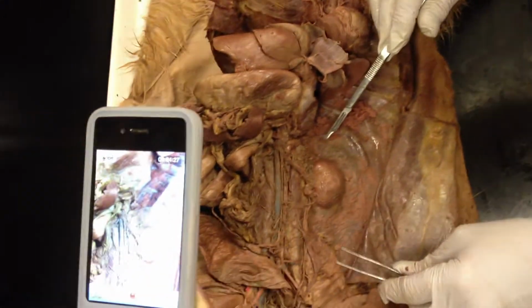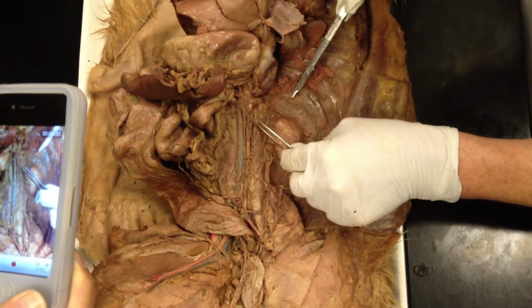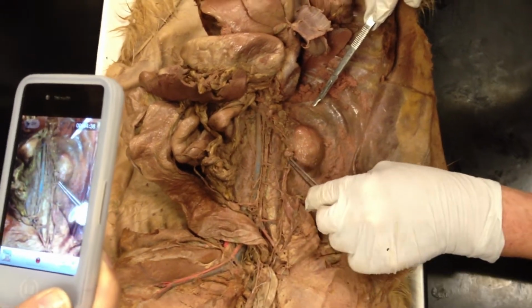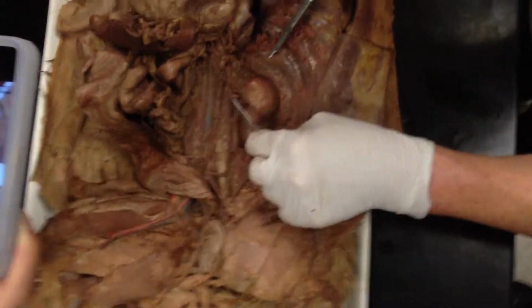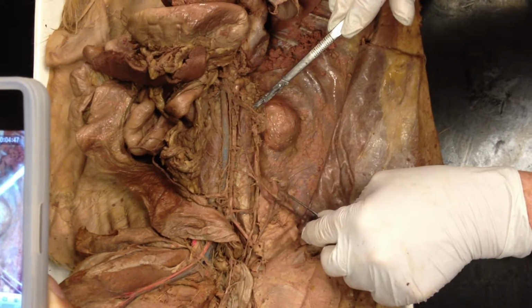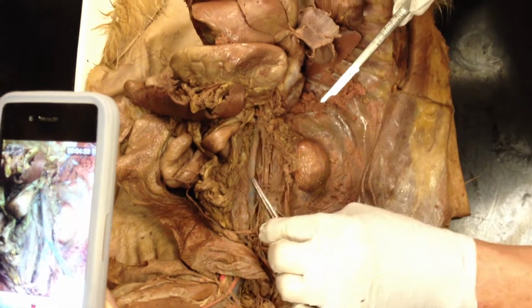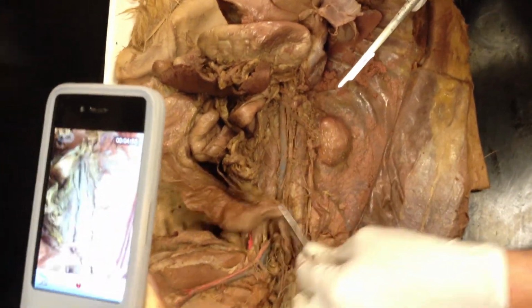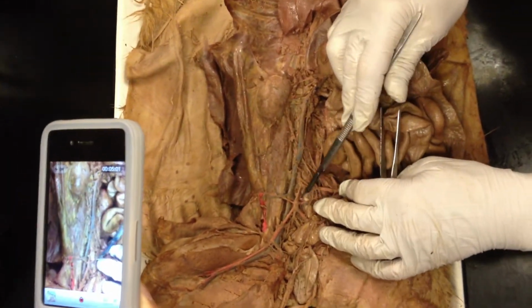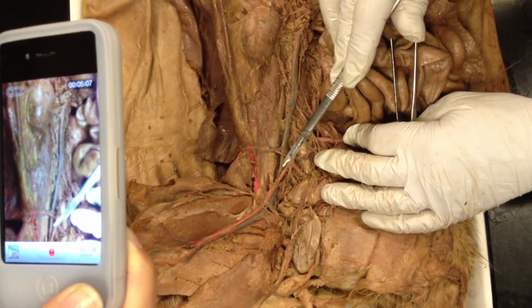Now what will happen is the spermatic vein will dump into the left renal. And again, you can't really see it all that well, but this structure would be going right into left renal. So that would be the spermatic. Now coming down, we're going to have the inferior vena cava. Then if I shift everything again, we're able to see the beautiful iliolumbar artery and vein. Then we're going to see a split.